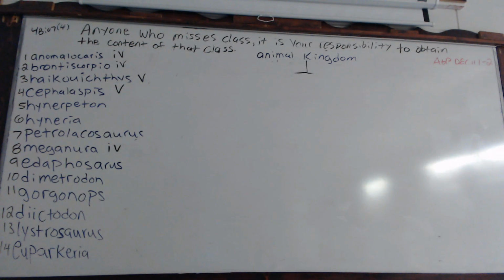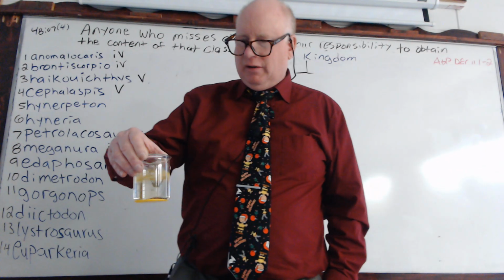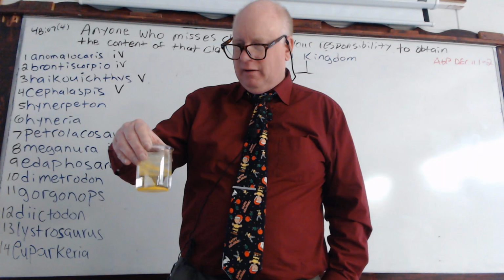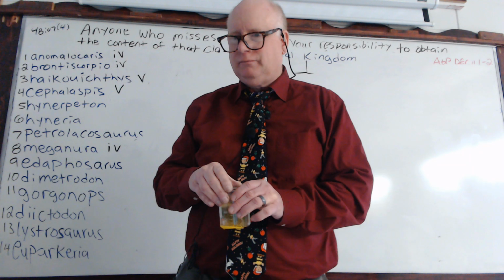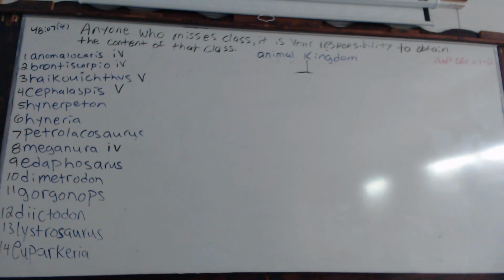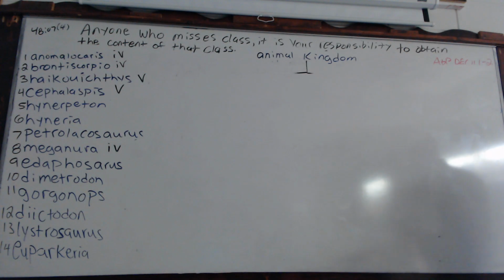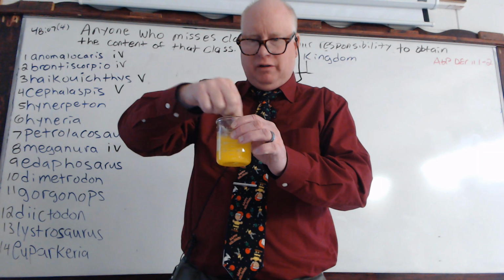And we could actually disturb this. I don't want to spill any either. Okay, so if we were to, like I had mentioned, try to slightly disturb this, just take parts of these tongue depressors and stick it in here and swirl it around.